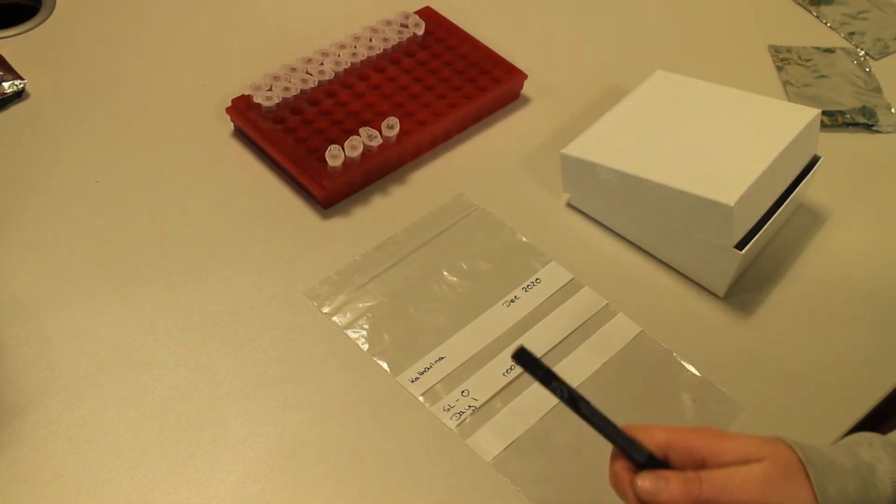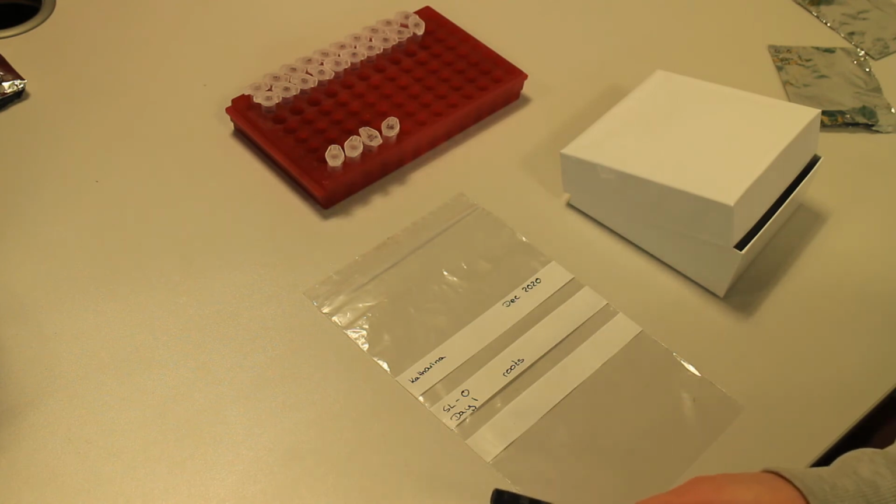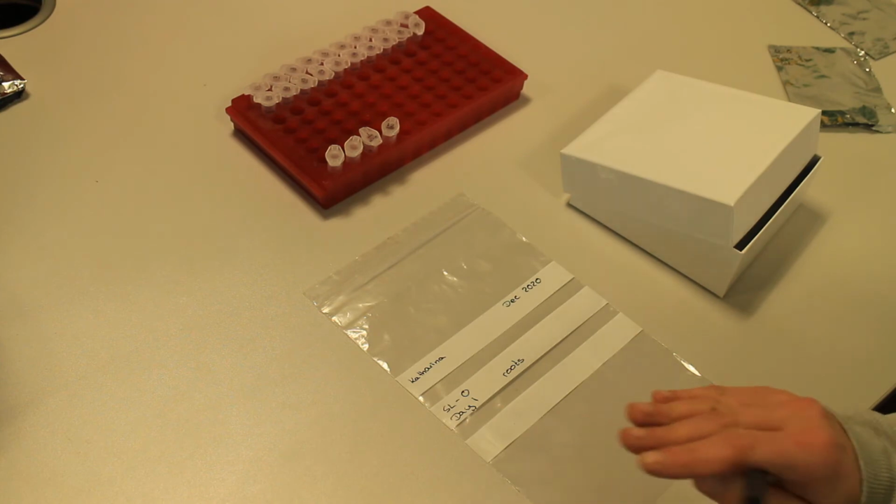Always bear in mind, if your samples are not properly labeled, they might be thrown away. That's the risk. And you might not be able to identify them either, right? So keep that in mind.